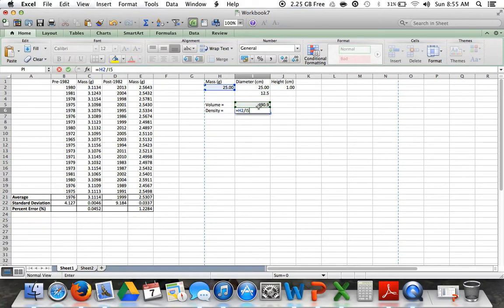So to check your work, you put it into here, and then you can do density really quickly if you have your volume adjusted for everything. Just re-click your density formula, drag down, and all of a sudden you have all your densities. So now our density is 0.0509 grams per centimeter cubed. So that's our density in this example.